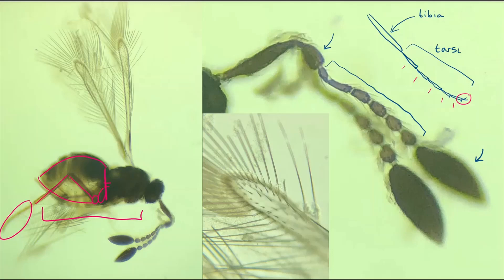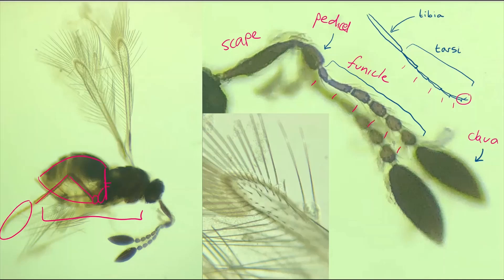Next I need to look at the segmentation of the funicle. In fairyflies like this one, the antennae are split into four main parts: the scape at the base, the pedicel, the funicular segments, and then the clava — or club — at the end. I can count six funicular segments here rather than five or seven, which takes me to the genus Lytus.